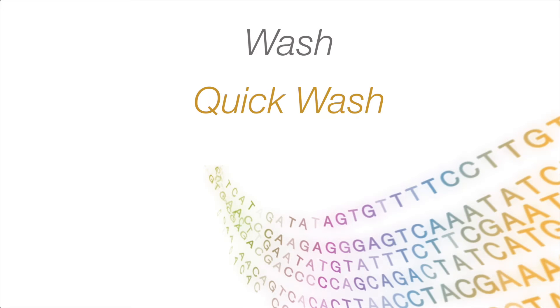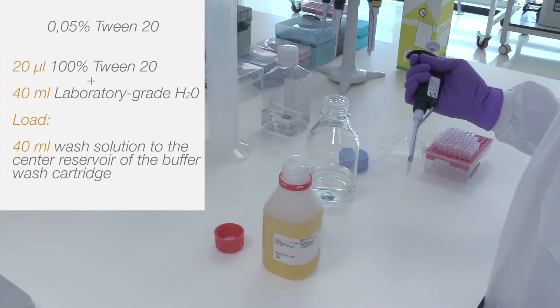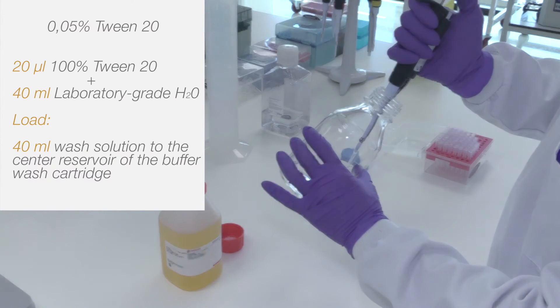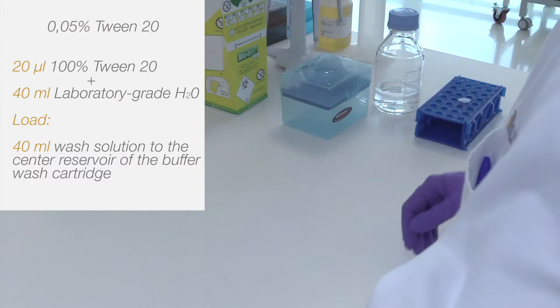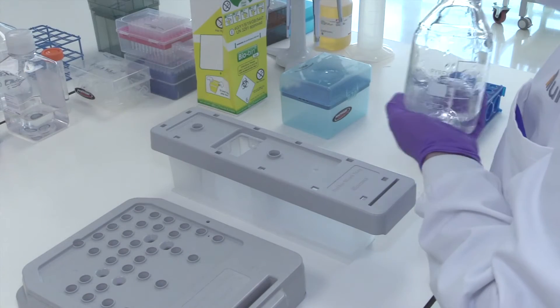How to prepare a quick wash. Prepare a 0.05% Tween 20 solution by combining 20 microlitres of non-diluted Tween 20 and 40 millilitres of lab grade water. Load 40 millilitres of this solution into the centre reservoir of the wash buffer cartridge, as depicted on the screen.